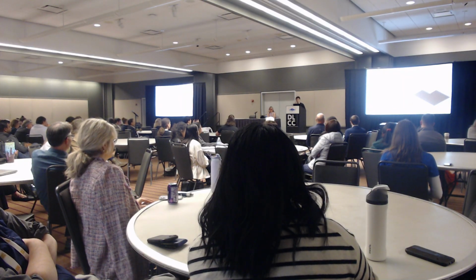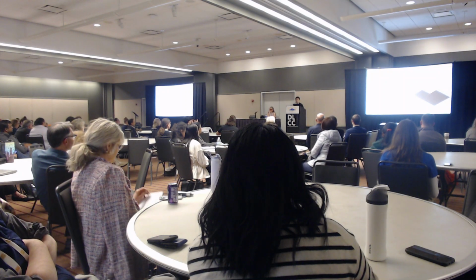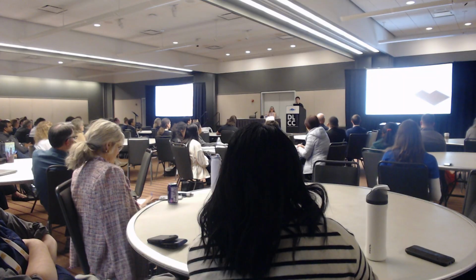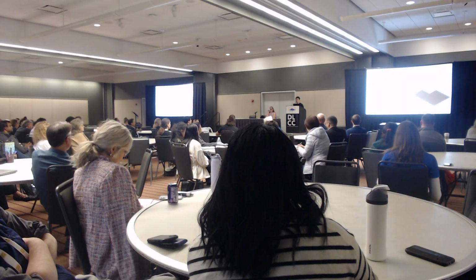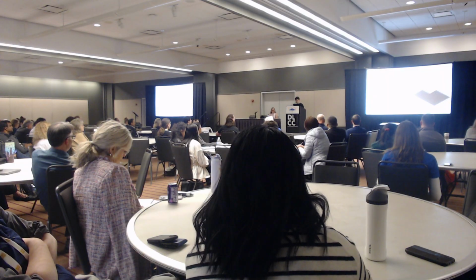Hello, everyone. I'm Yanxiang from University of Pennsylvania. Today I'd like to introduce several spatial technologies we developed that can profile different types of molecules within the tissue section. We call this spatial multiomics.